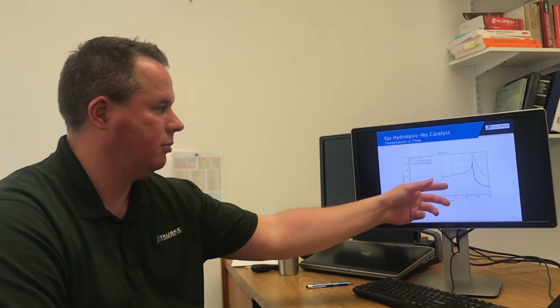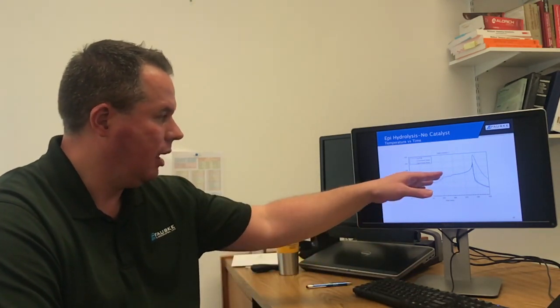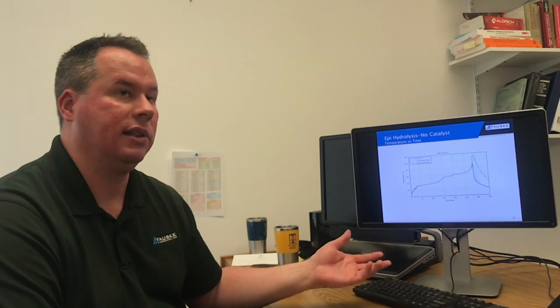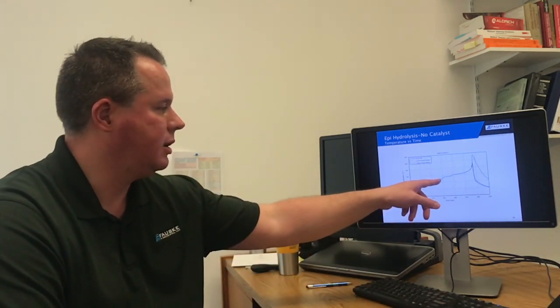It ended up at pretty much a similar temperature. The temperature was a little bit higher because the epi was not being added cold at room temperature. It was actually heated up to 80 degrees C in this test. So it did get to a slightly higher temperature, but epi has a very low heat capacity in comparison to water, so the peak temperature was relatively the same as in the first test.